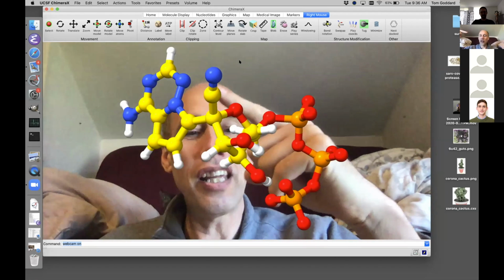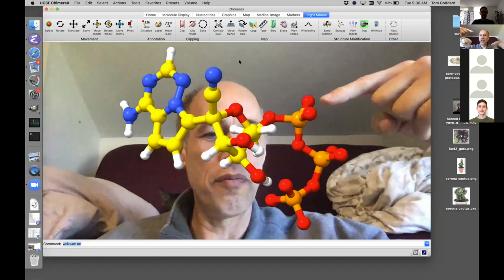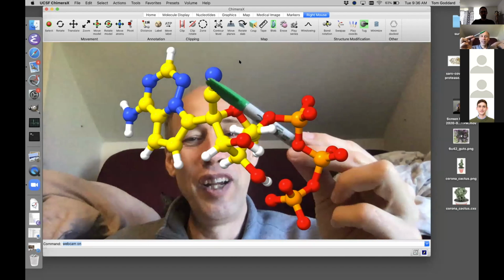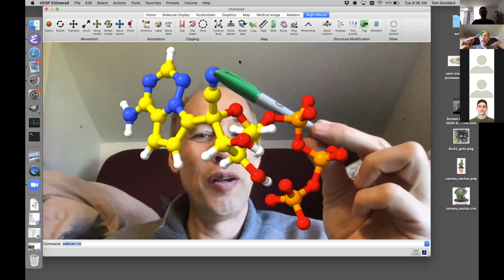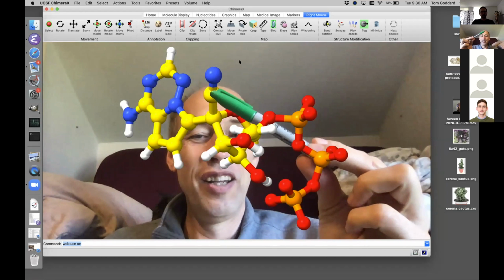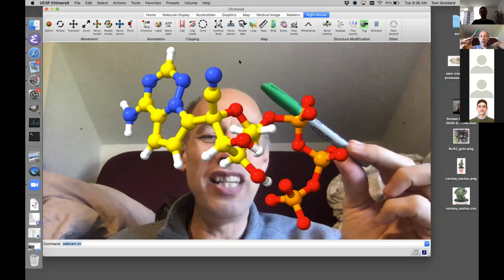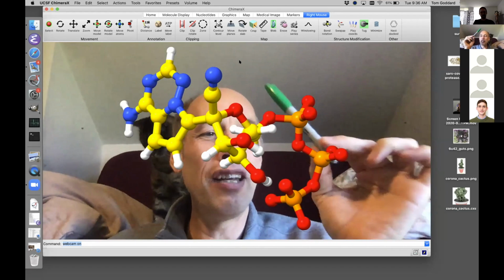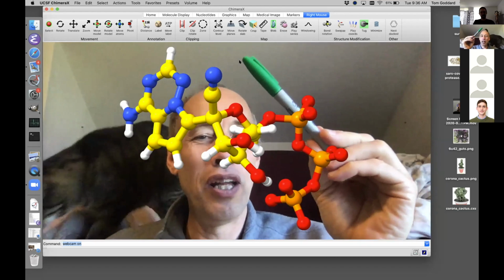It can work, I could point to things from the side, but with the magic pen here, when I point, this green pen ends up in front. What's going on there? Well, this gets back to the green screen question before. My little webcam command, if it sees something green in the video, it puts it in front.